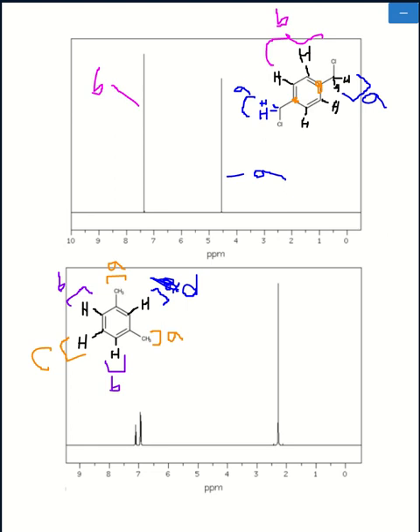However, on the actual spectra, there are only 3 main peaks, which would be the main peak right here, the main peak a little bit upfield of 7, that means around, say, 6.9, 6.8 ppm, and then the peak a little bit past 7 ppm, a little bit downfield, maybe 7.1. Those are 3 unique peaks.